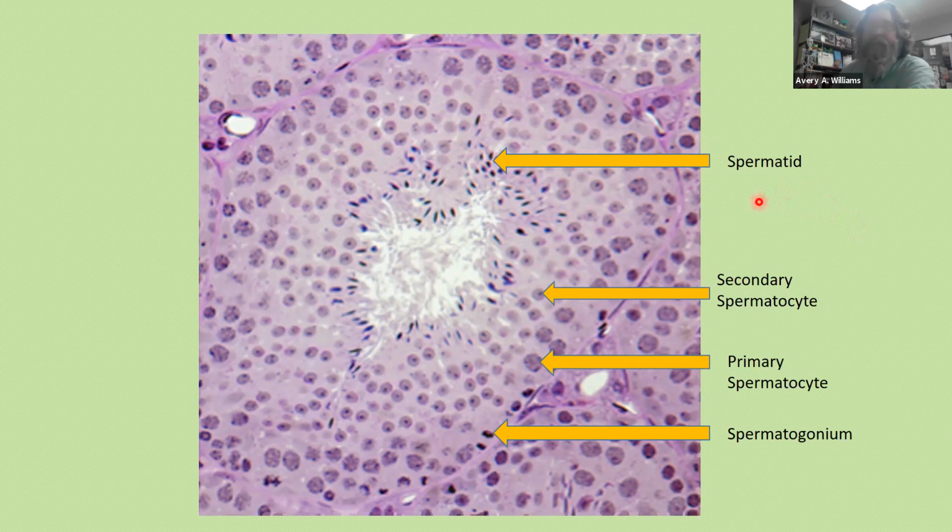Well, spermatids are immature sperm cells. They're not mature yet because they don't have little flagella and stuff. So the spermatids actually have to mature and develop a tail. They have to metamorphose. So they're the transition, and they go from spermatids to spermatozoa, or mature sperm cells. It's easy to recognize because you say, hey, they have a tail on them. So I think I show you that next.